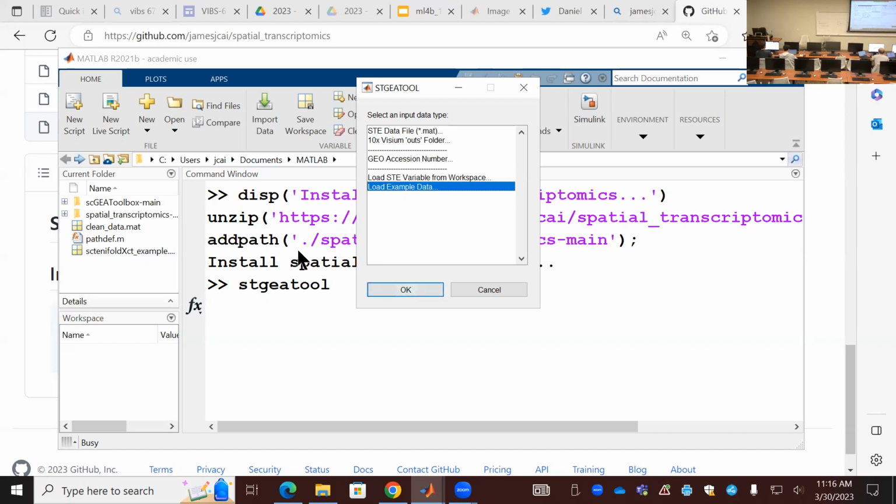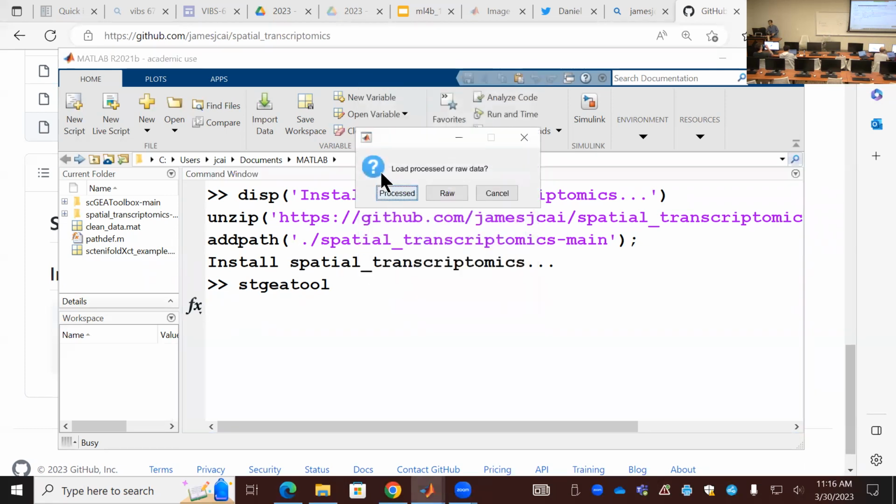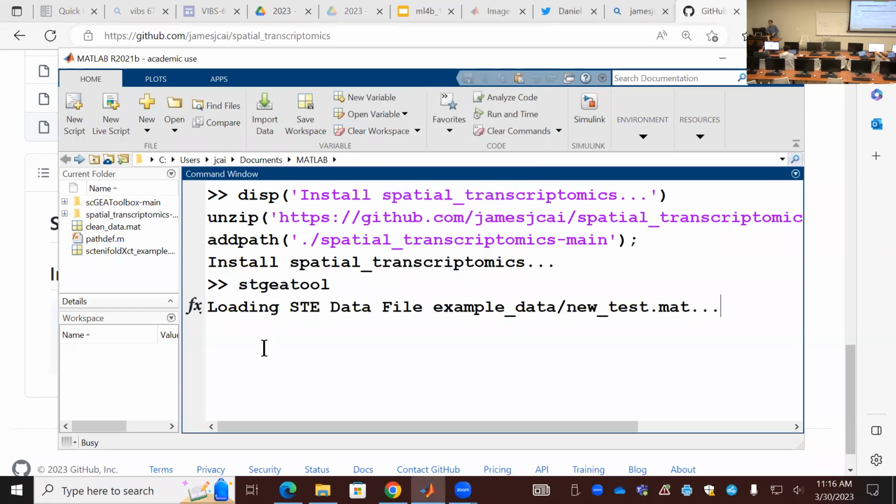Yeah, you can go ahead and load and process the example. Yeah, good. Feel free to load the example and process it, then you can have some quick idea of what's in there. So I just click this to get it processed.